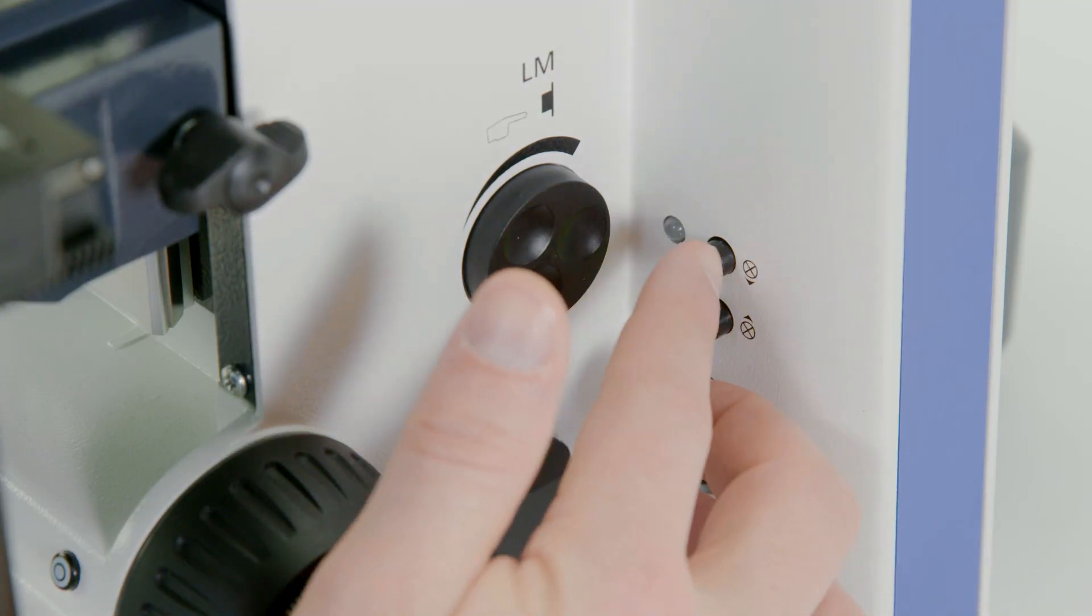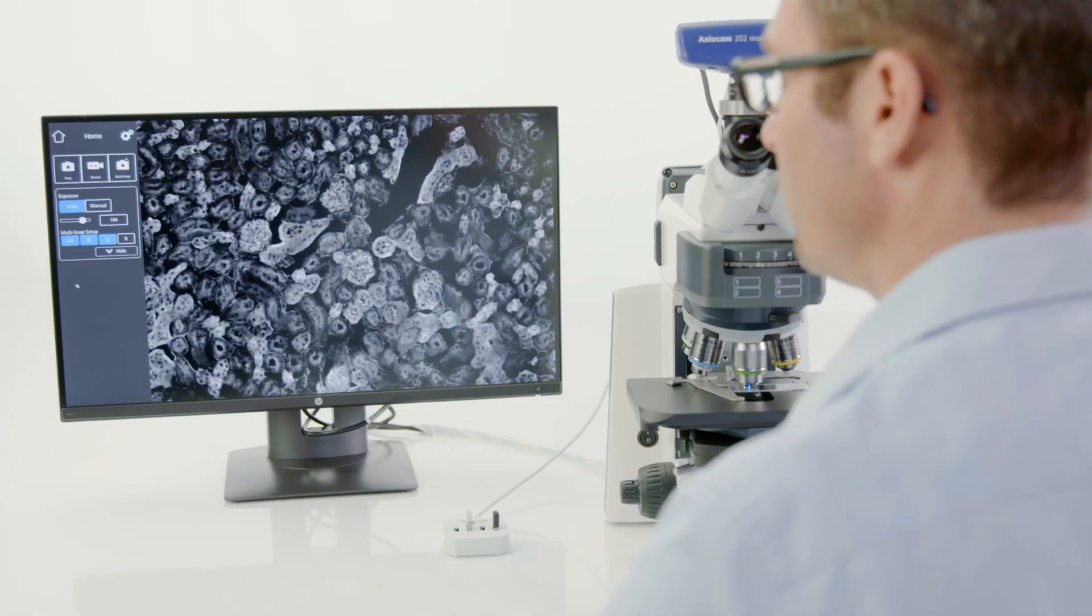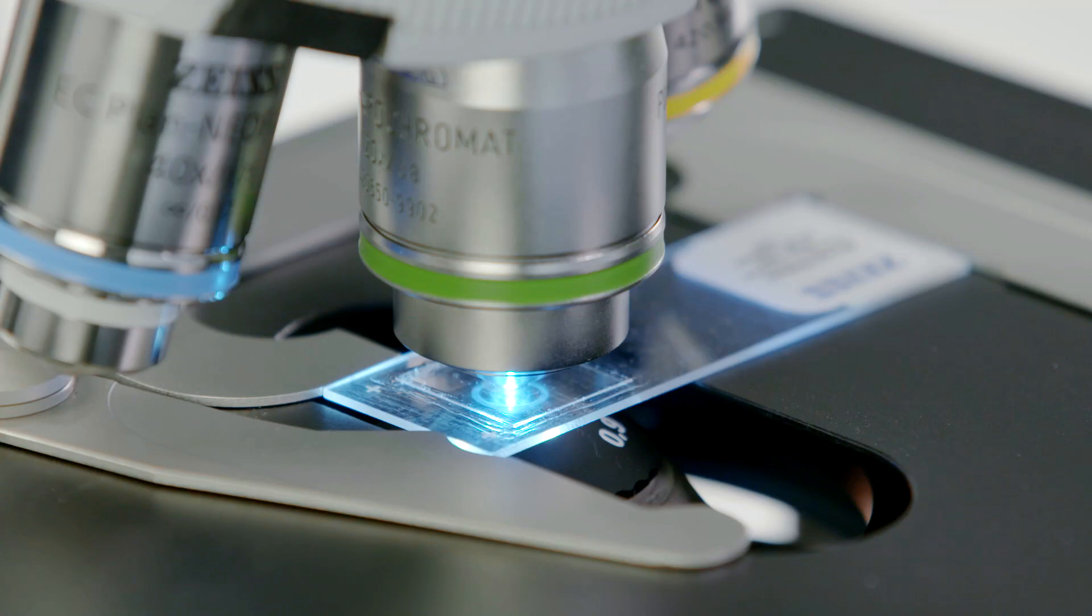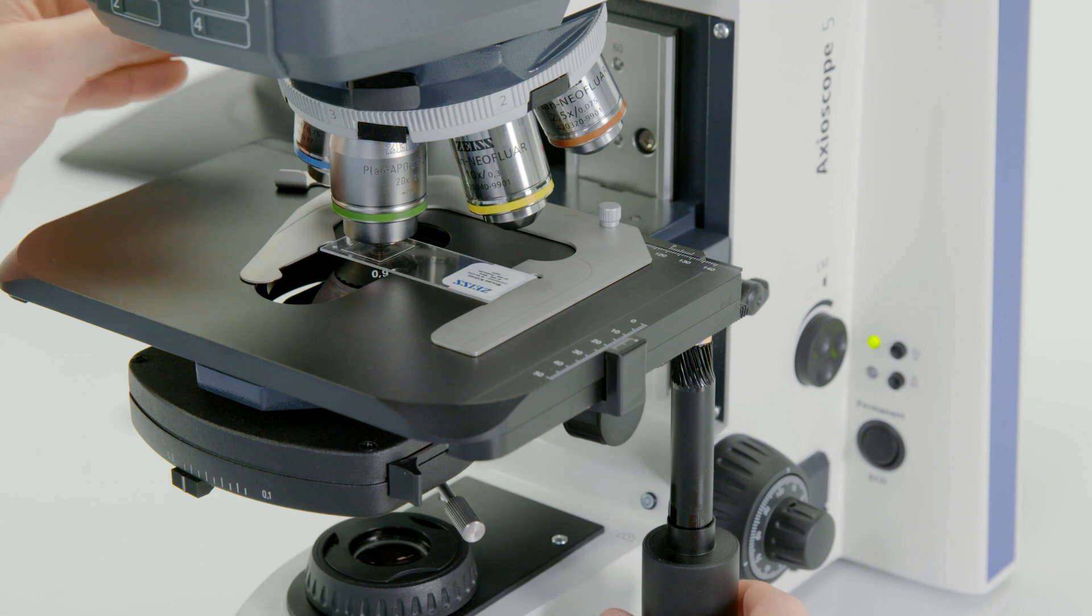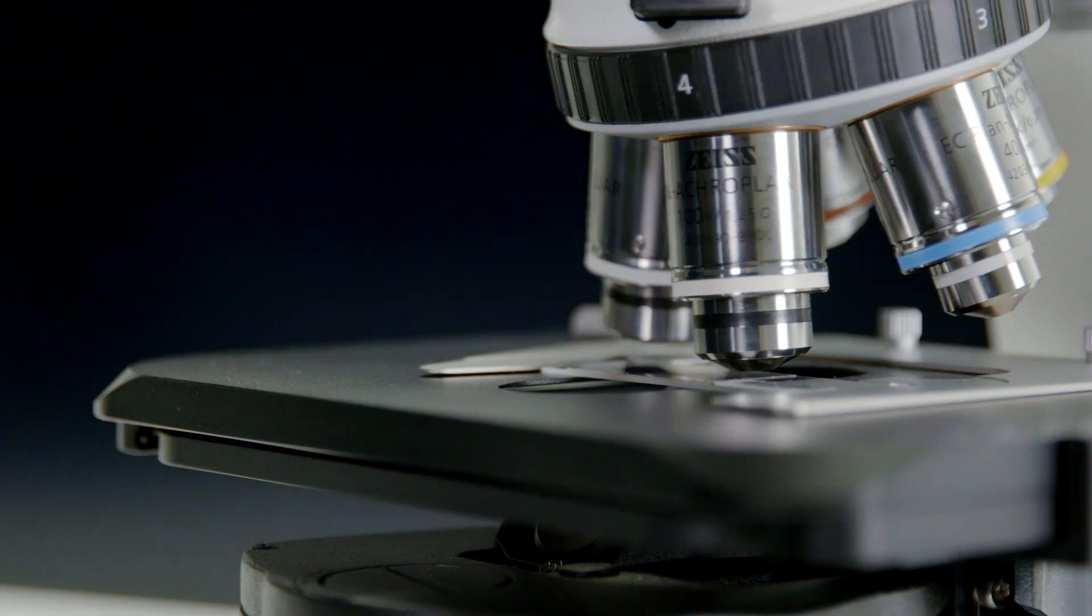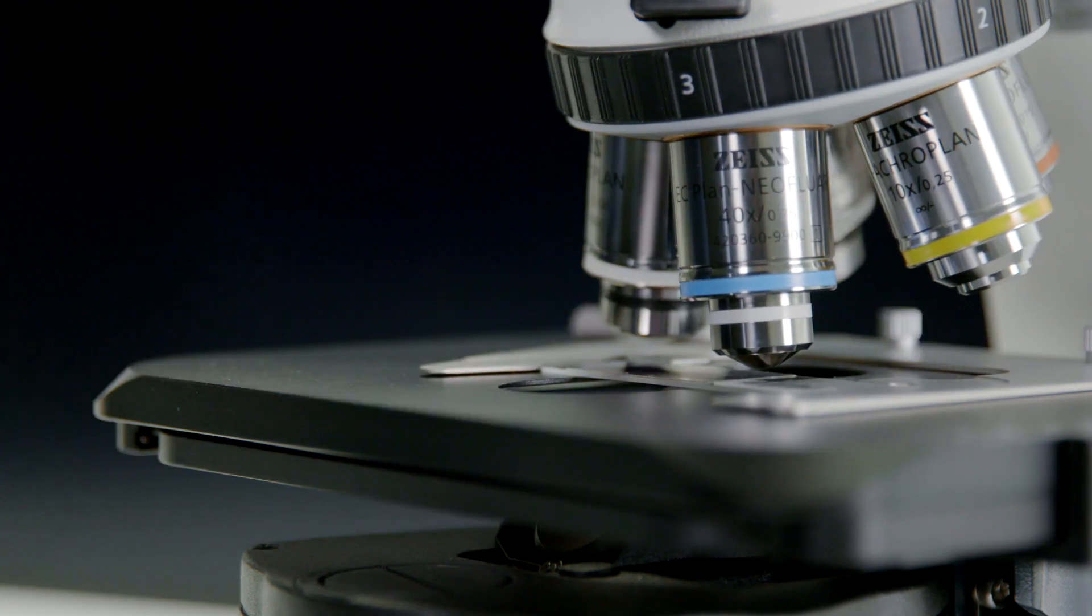Now you're ready to switch to the fluorescence mode on your Axioscope 5 microscope. Toggle to the UV LED since DAPI provides a strong fluorescent signal. Use a low magnification objective to locate and focus your sample, then switch to the magnification you need.